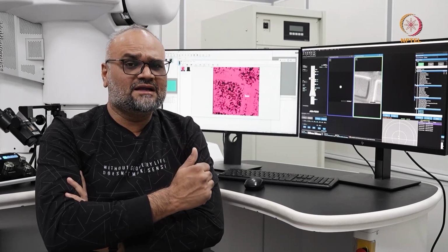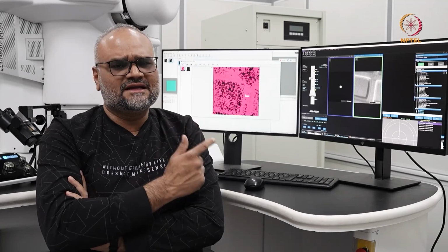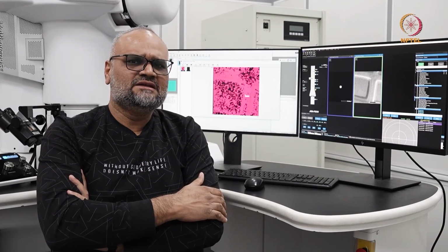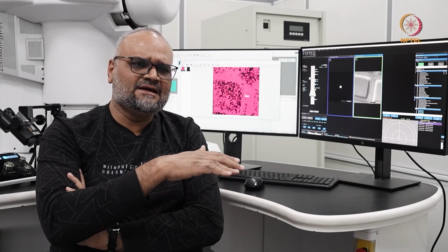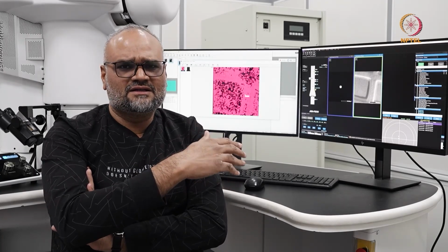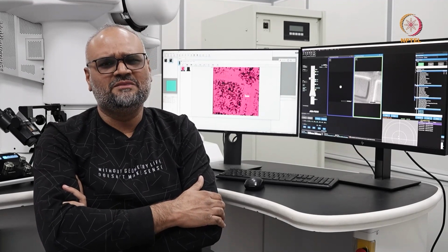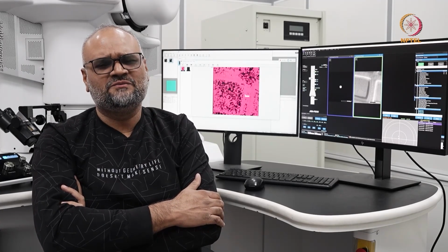And in order to get a good quantification, you should see that your signal is good. Ensure that the detector is actually capable of collecting signal from the specimen at that particular orientation. Sometimes you might be interested in one particular crystallographic orientation, and the angle of the holder at that particular orientation might be completely off, and your collection efficiency might not be very good. In modern day microscopes where you have annular EDS detectors, this may not be a big problem. So all these factors actually play a key role in getting meaningful data from your STEM images.